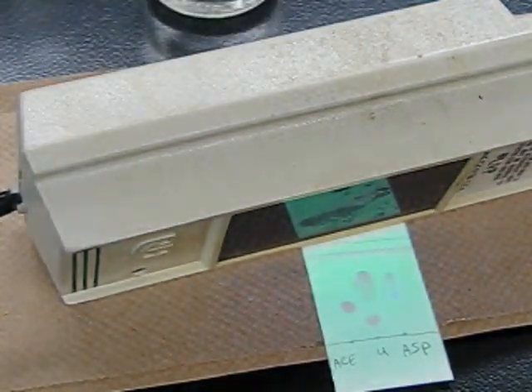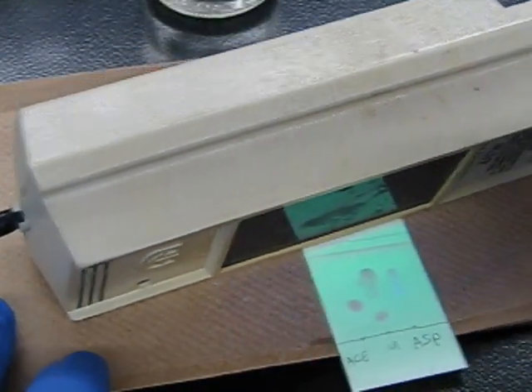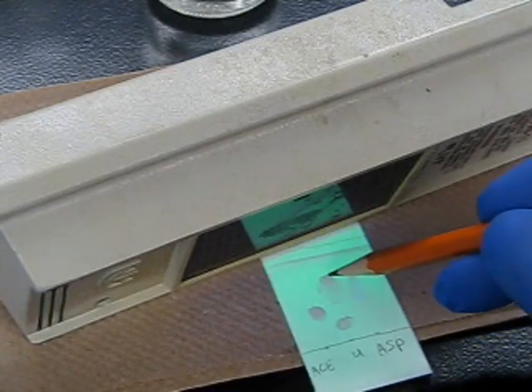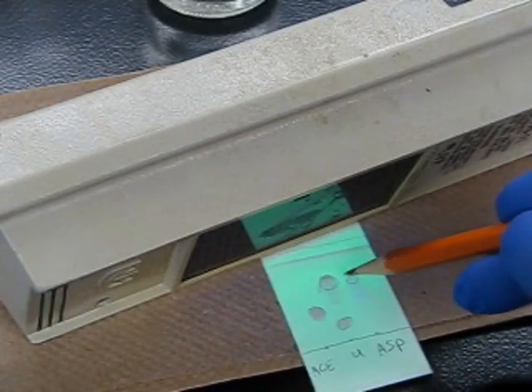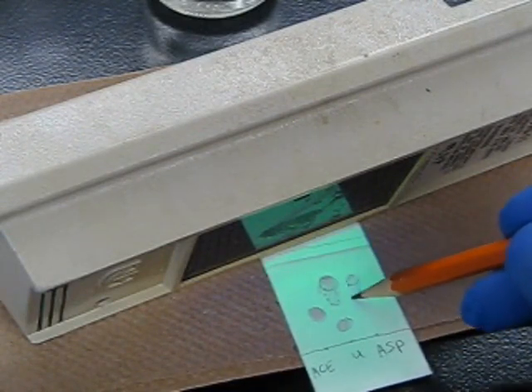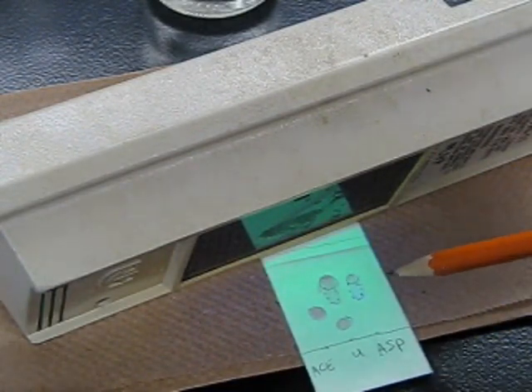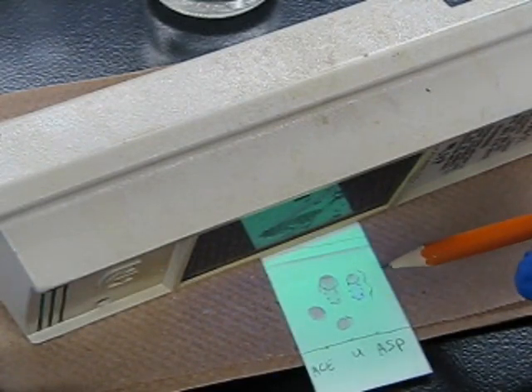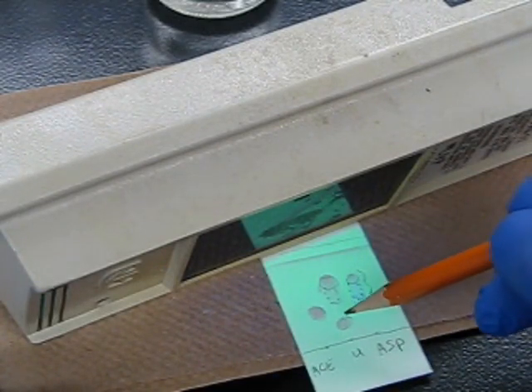above the spots that you put down will show how many components you had from that solution that you spotted. For example, under the acetaminophen, there's only one spot. Under the unknown, there's more than one spot. What you should do is circle the spots with a pencil, and then if there are other notable markings, you may want to put a dotted line around it or make a note in your diagram when you draw it in your lab notebook.